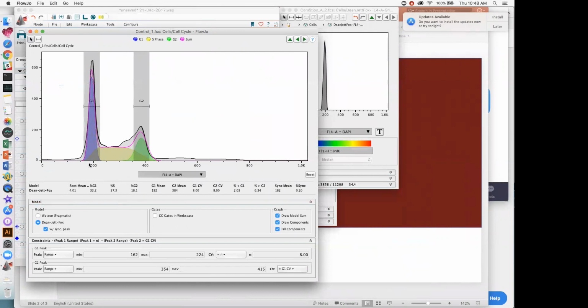So when I was constraining the G1 phase on this model, I constrained the region, and then I was looking to see how well my blue histogram here kind of meets up with the histogram that is outlined in black. Personally, I like it to fit a little bit wider so that it occupies the vast majority of space here. But as we saw when I played around with this CV a little bit, the better value was slightly smaller. So when we have this as a narrower CV here, we set this to 7. If I click off of this, that RMS goes down to 3.9.